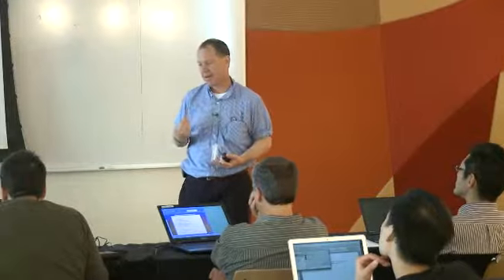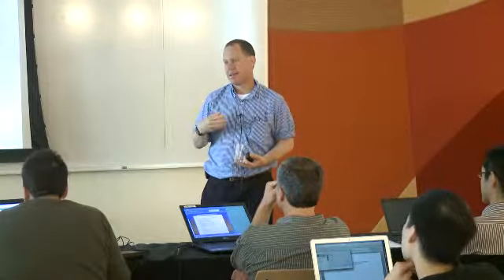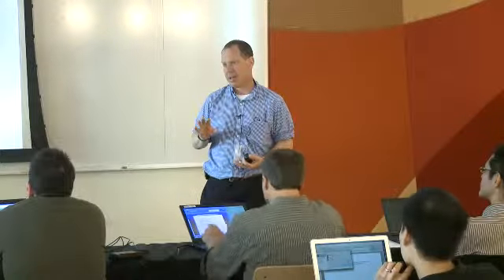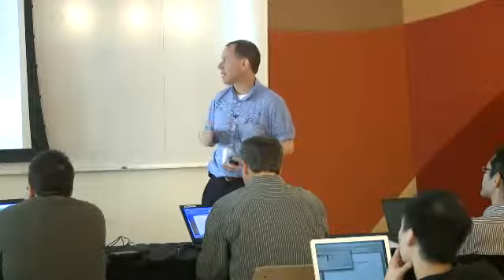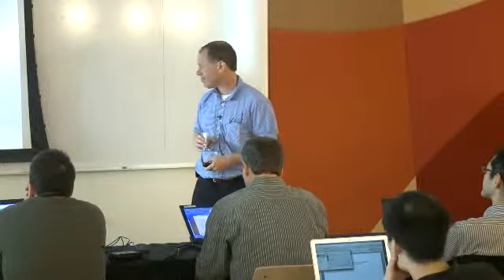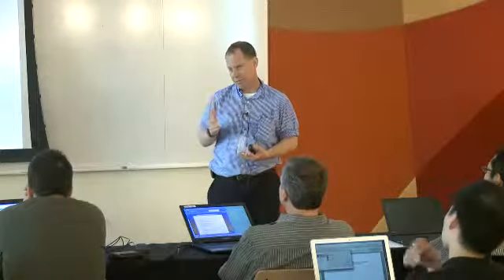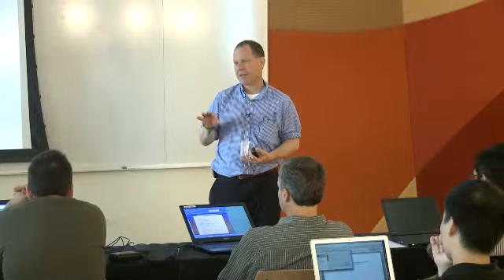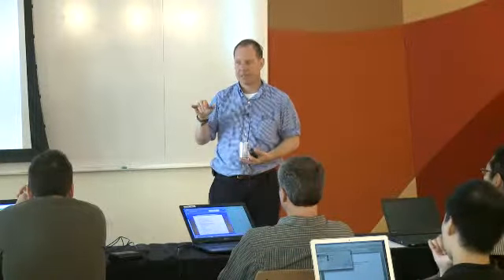But in spite of that, we may transition some of our library sequencing, in appropriate experimental designs, to paired-end longer read sequencing. The hypothetical advantages of longer reads have to do with alignability as one factor. In cases where you're looking at DNA that has a repetitive character, a shorter read might not align, whereas a longer read might align.